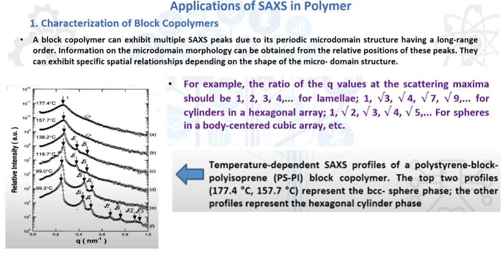Now, application of SAXS in polymer: what is the significance of SAXS in polymer? First of all, we can characterize a block copolymer from small angle X-ray scattering.